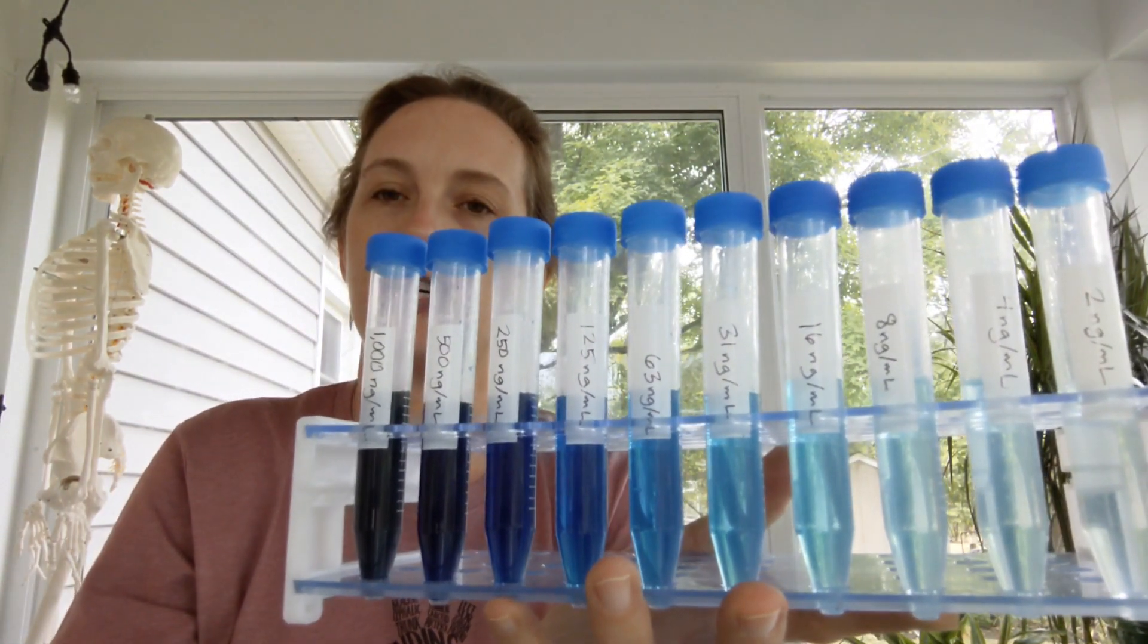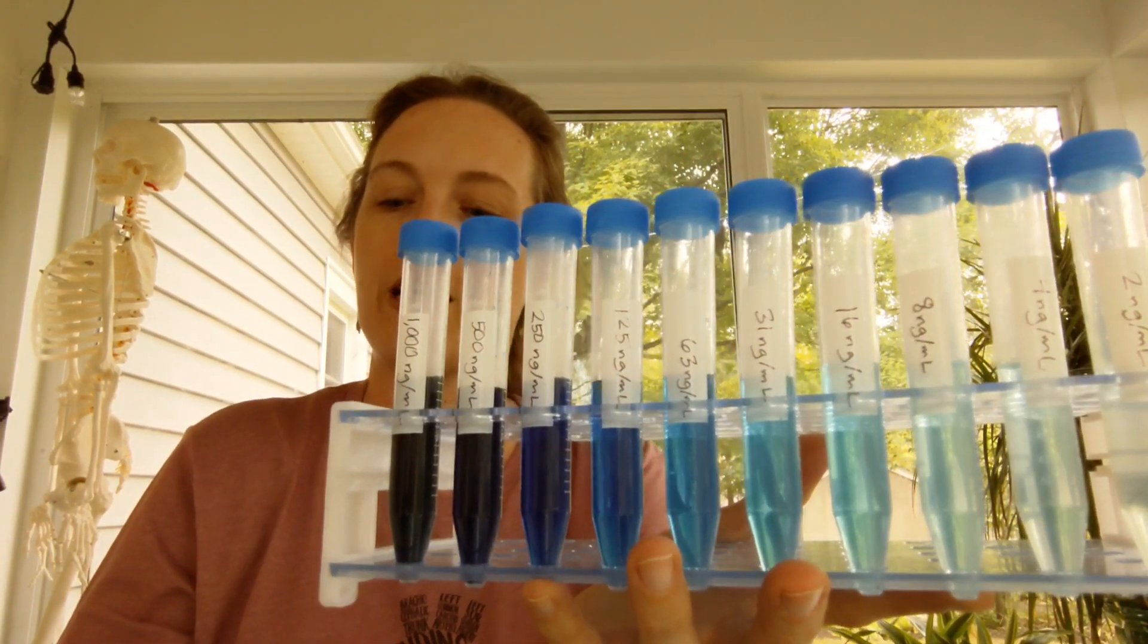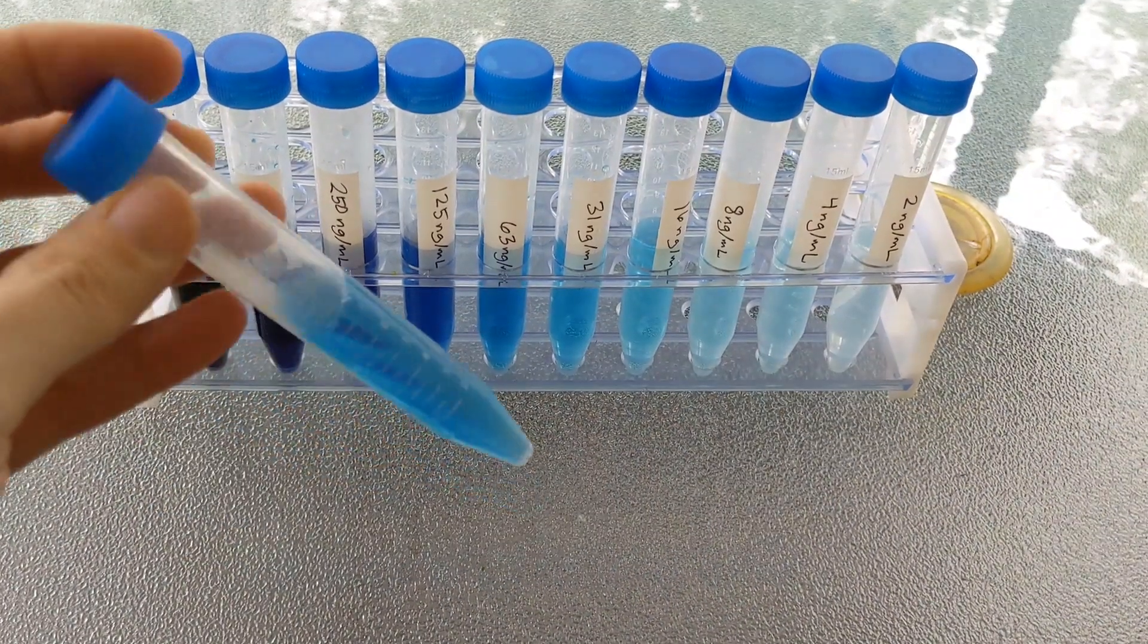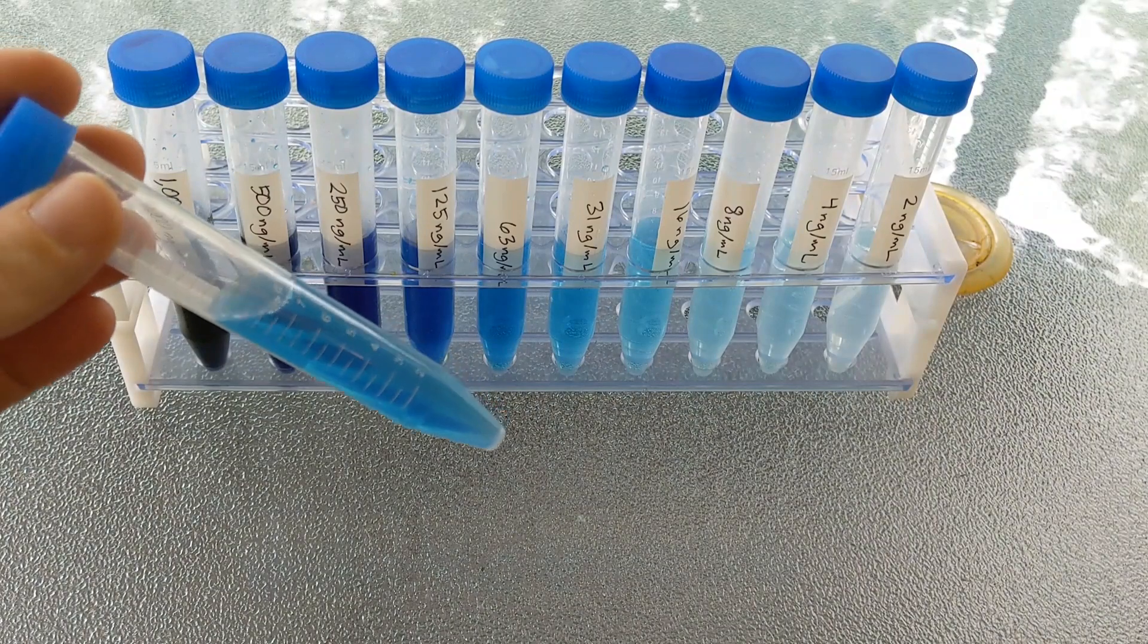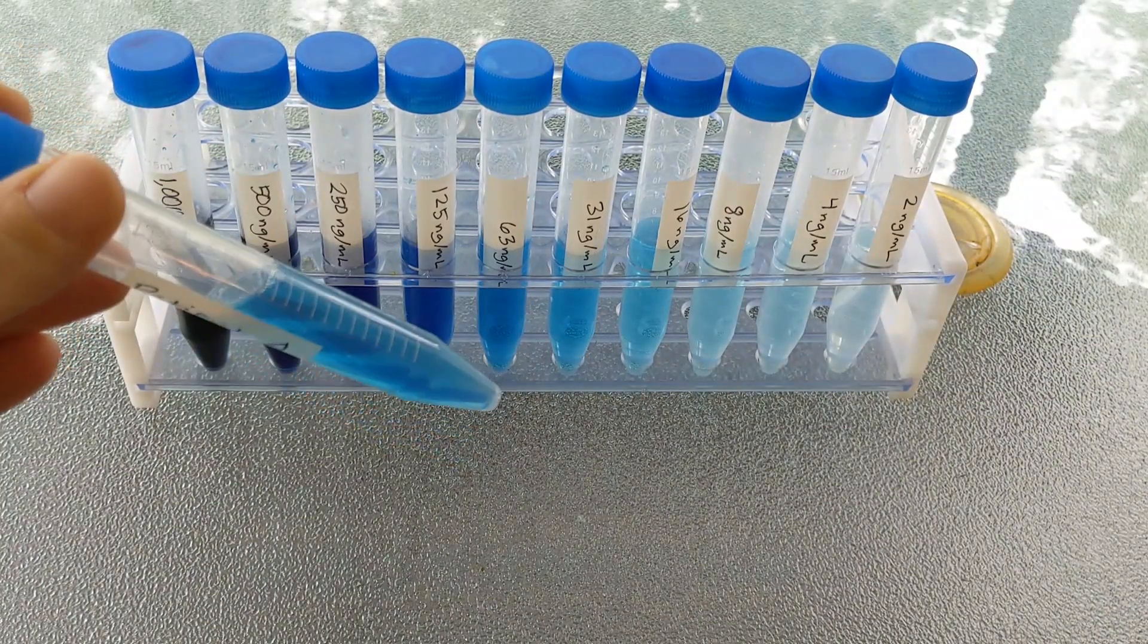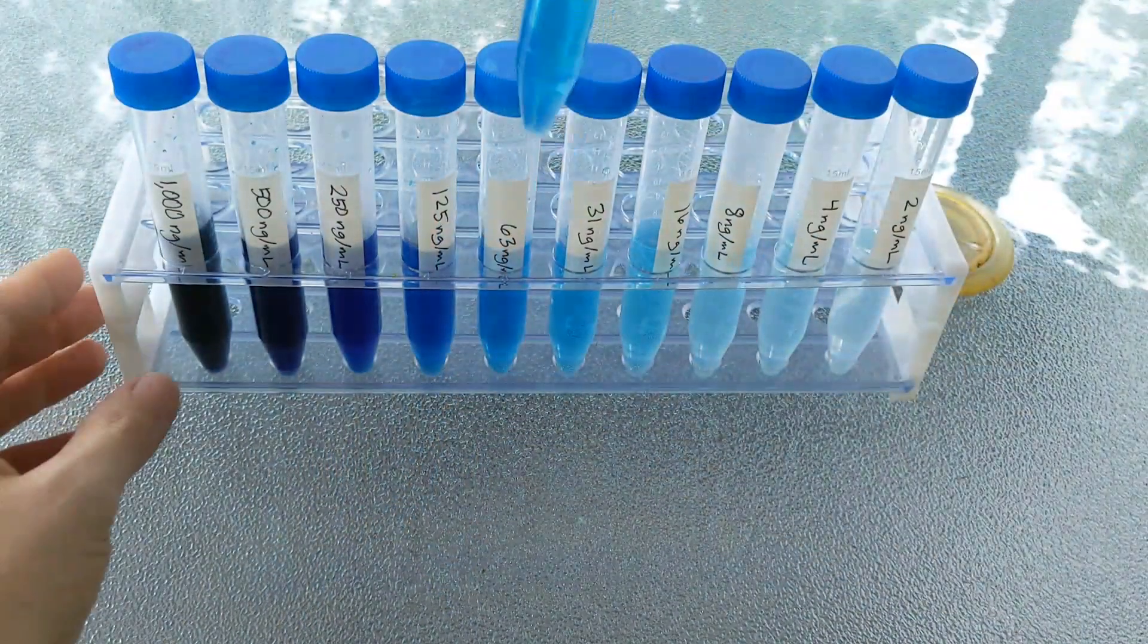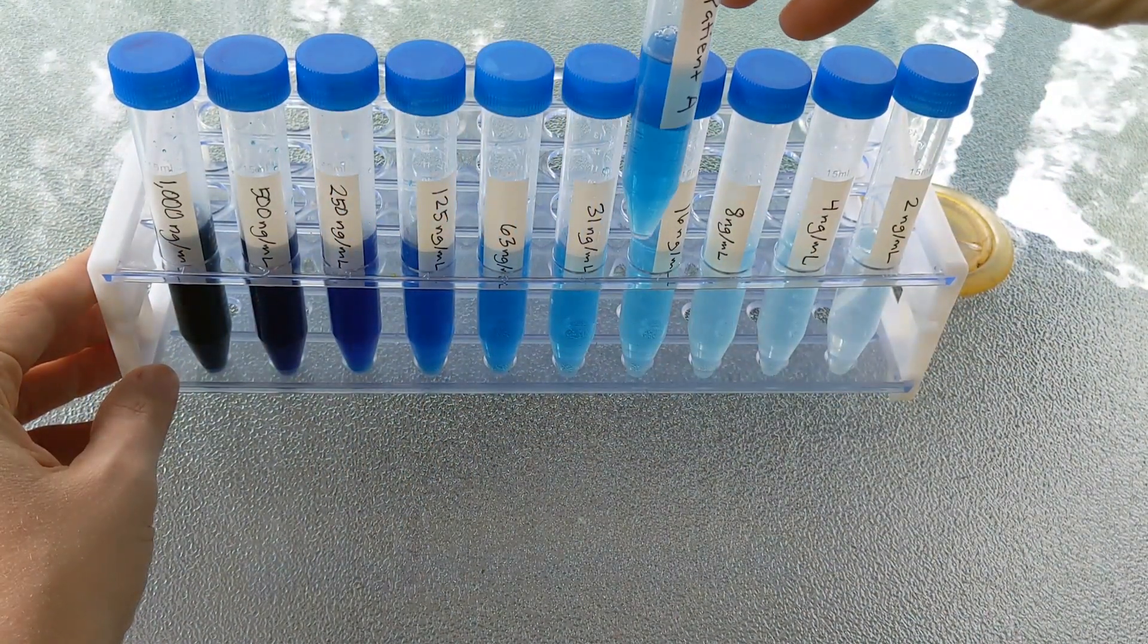And then we have patients to compare to. So I'm going to flip the camera so that we can compare each patient to the serial dilution. ELISAs are really cool because you don't just get positive or negative results. You also, for the positive results, can figure out how positive somebody is. So what you want to do with each patient that you get is try to come up with the best color match you can.